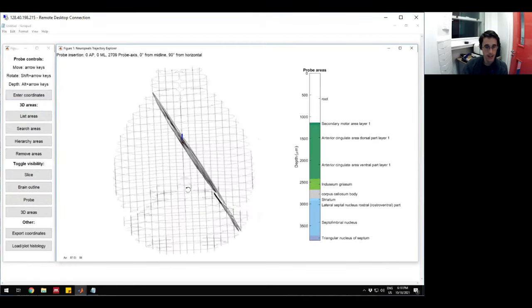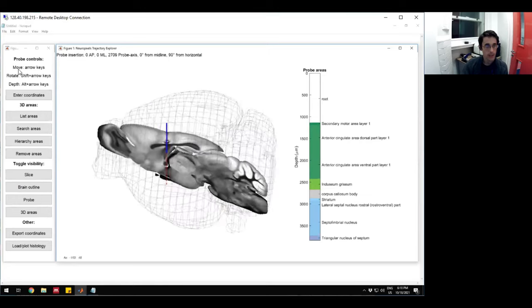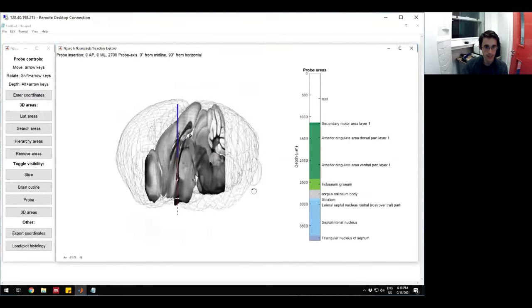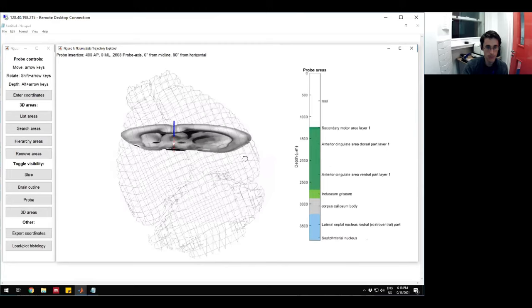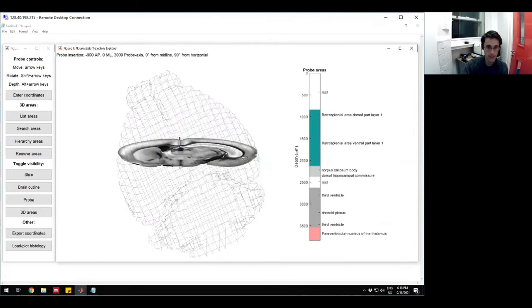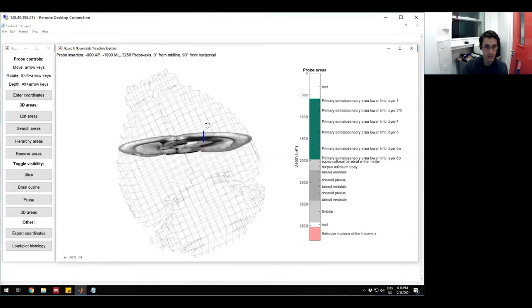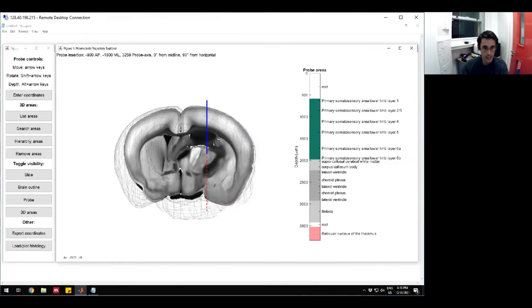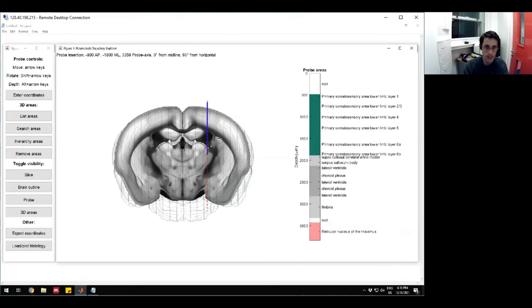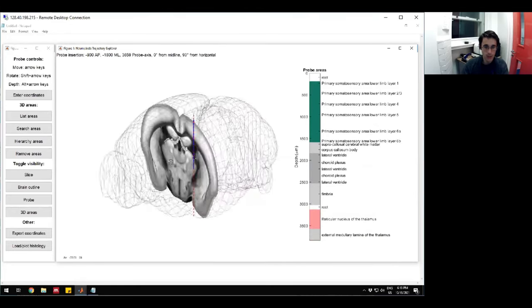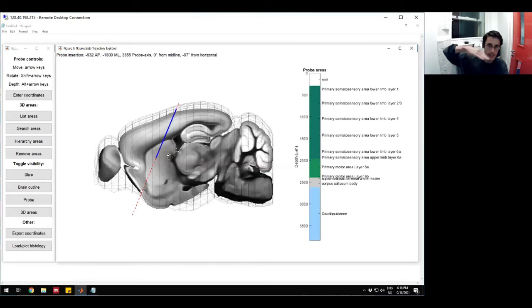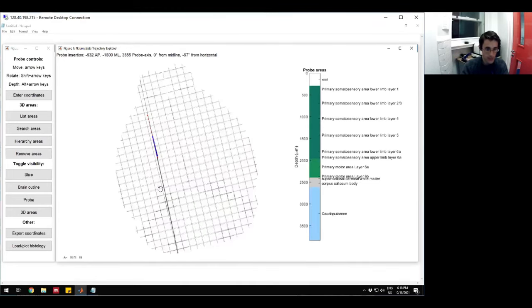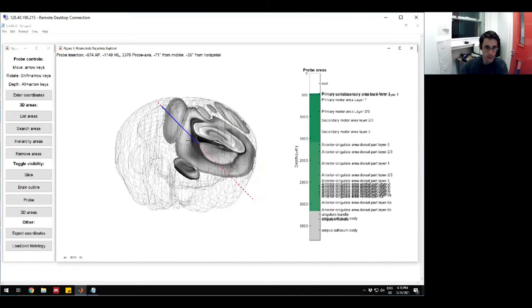The way that you move this around is just by clicking and holding. Then to move your probe, the directions are listed up here. The arrow keys move it front, back, left, and right. You can see if I press the forward arrow, it will move forward in the brain. To control the depth, if you hold the alt key and go up and down, you can change where your probe is depth-wise. You can rotate the probe with the shift key. If you hold shift and you press forward, that rotates it in the anterior-posterior direction. If you hold shift and hit right, then this rotates it along this dimension.